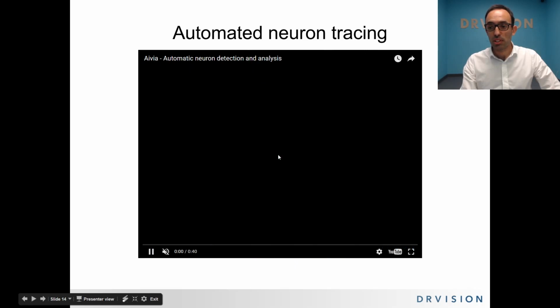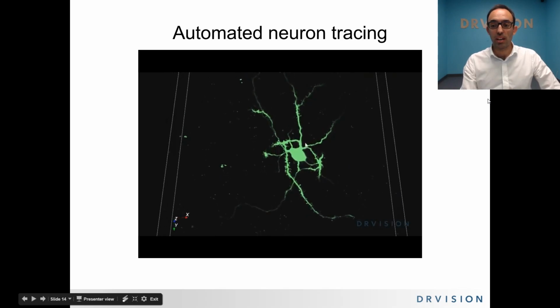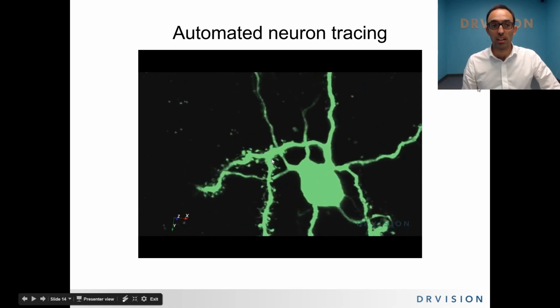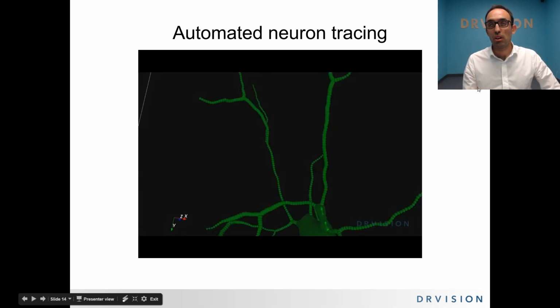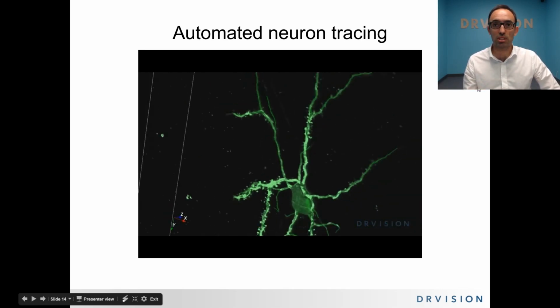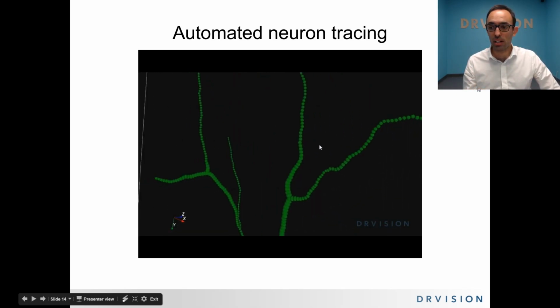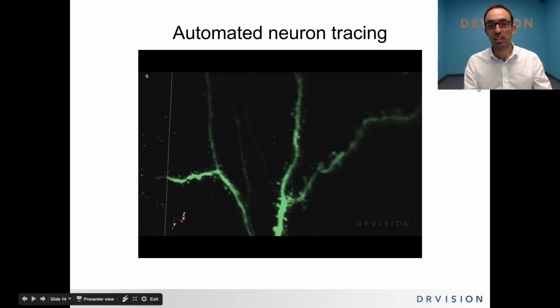The detection itself is very quick. This is one example. It's one of the examples we have on our website as well, and it's on our YouTube page, which I encourage you to follow. We'll be adding more things there. And on the data set with 1,500 pixels by 1,500 pixels by 500 slices, it takes about 25 seconds to run the image analysis protocol. And the results we find are pretty robust, but they're not 100% as with every algorithm.